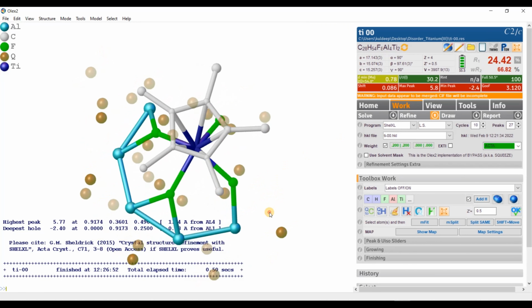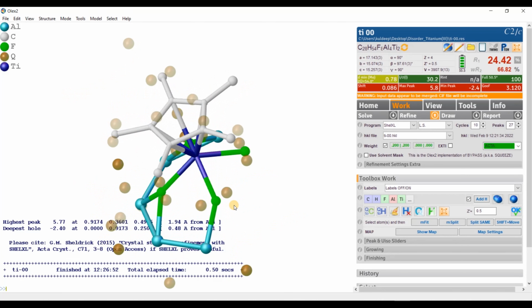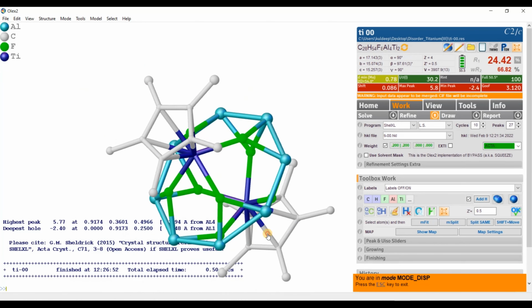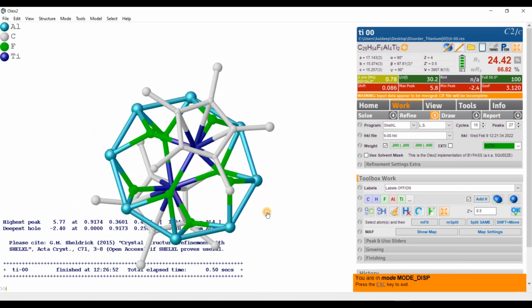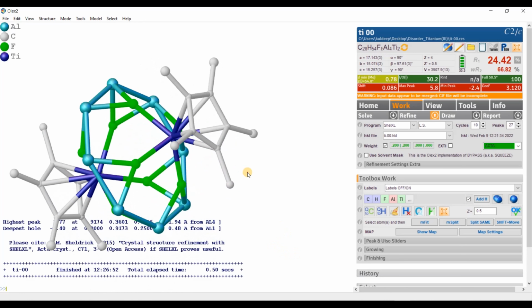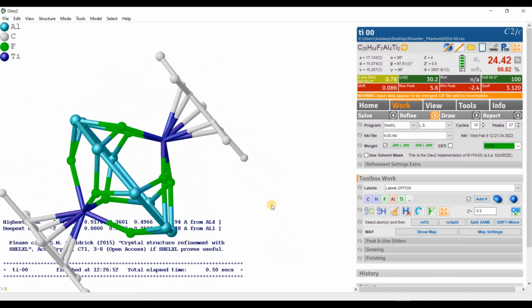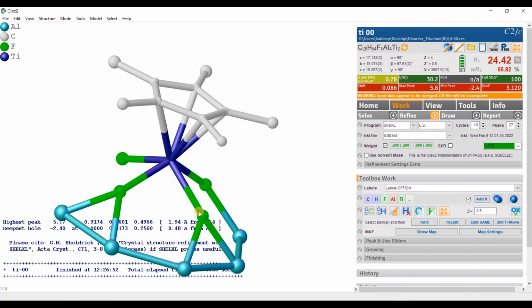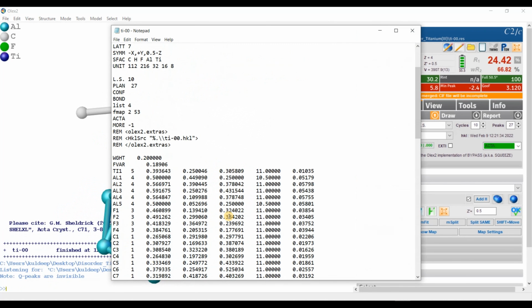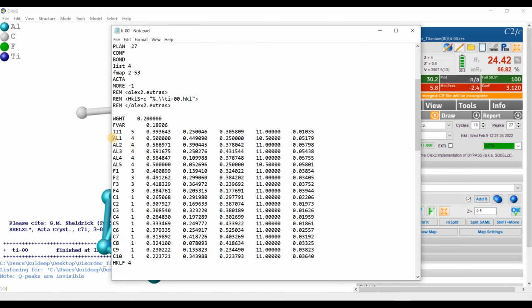Okay, so from here if I put the cubic off and grow the structure, I am getting a structure like this. A case compound is visible. So if I visualize the atoms in some program like MERCURY, if I fuse first and then edit the RES file, then I can see the aluminium atom 1 and aluminium atom number 5 are on a special position. They are only half occupied.